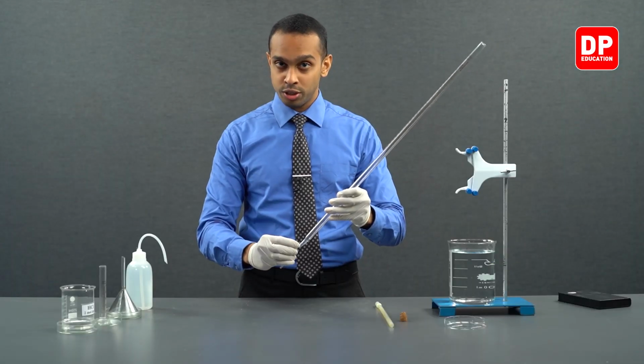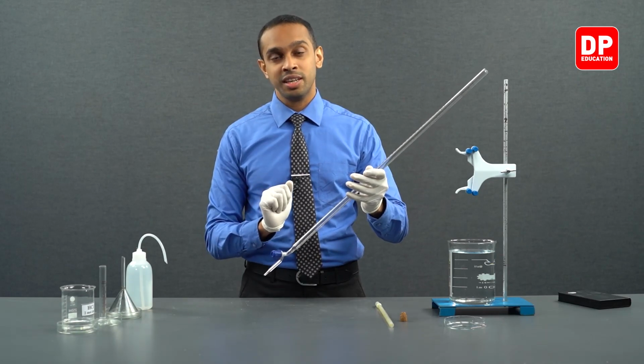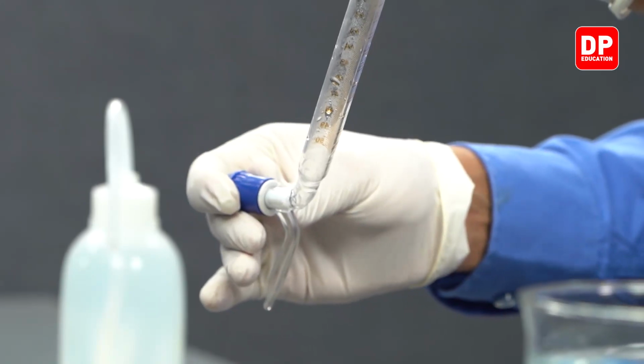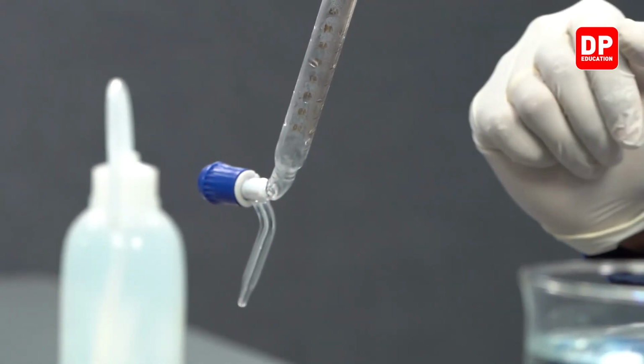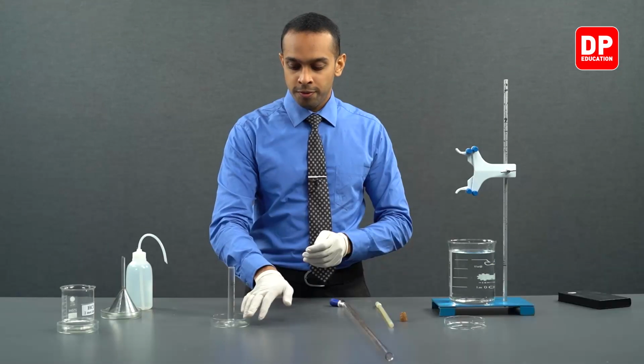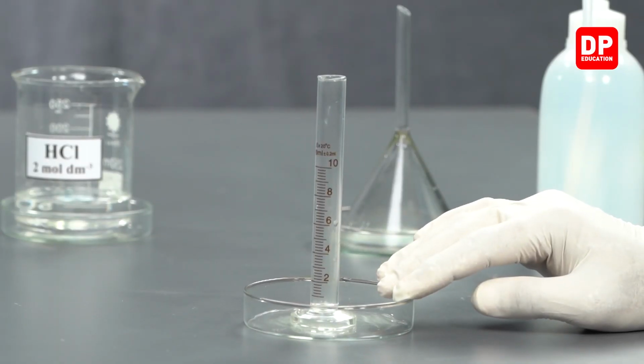So when you're handling concentrated HCl acid, make sure to not spill any HCl because it could be harmful. After ensuring that the burette is properly closed, we are going to be now adding 5 milliliters of HCl into our burette, measuring 5 milliliters of HCl with the use of our measuring cylinder.